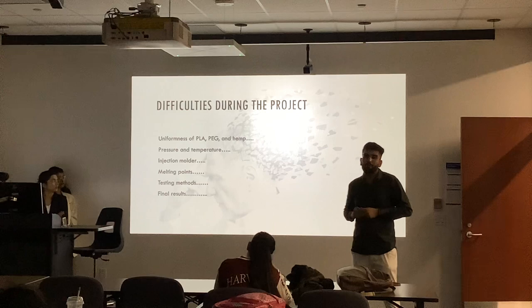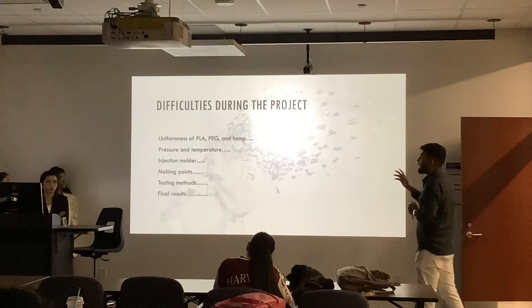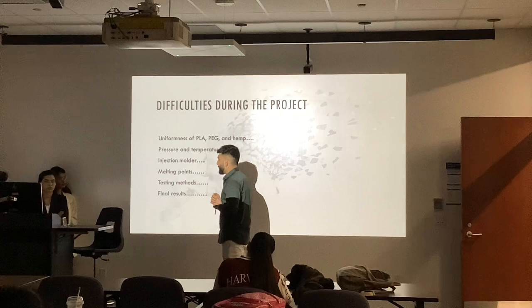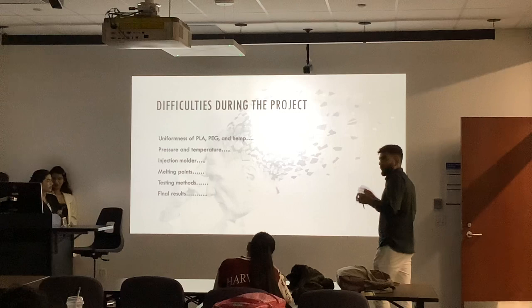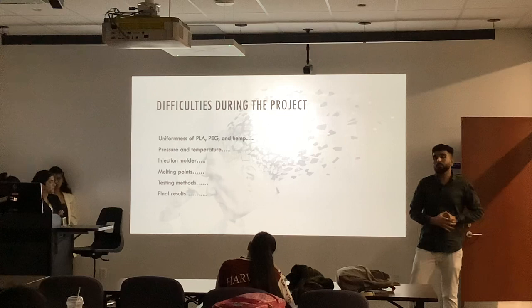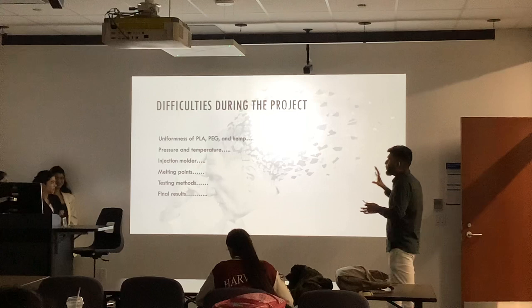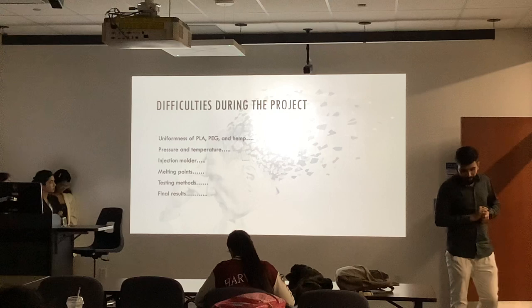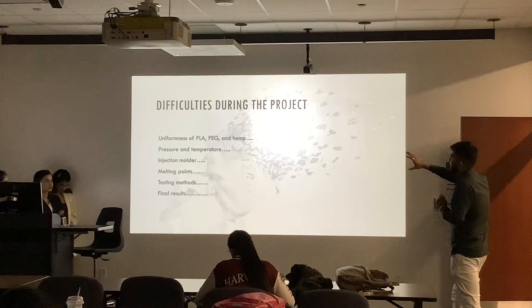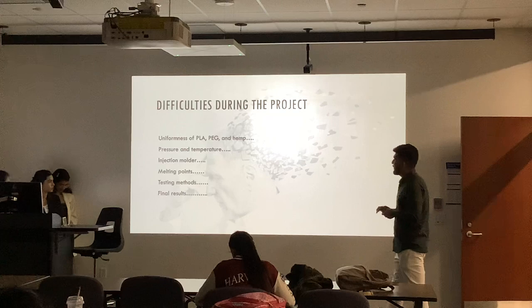Pressure and temperature: we used two different laboratories during the project. We were not getting the pressure that we needed — we needed 120 PSI pressure to make our dog bones, but we were only getting 80–90 PSI in one lab, and that caused delays in our work plan. The injection molder we used was not proper for our project, because we were not able to get proper dog bones with our chosen material. Melting points: in the initial stage with PLA, PEG, and hemp, the melting point of the three raw materials was totally different. But when we switched to PBAT, the melting point issues were resolved. We used three testing methods: impact tester, tensile tester, and microscopy, and we faced difficulties with all three.